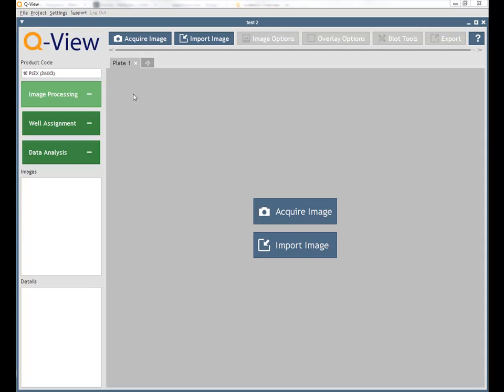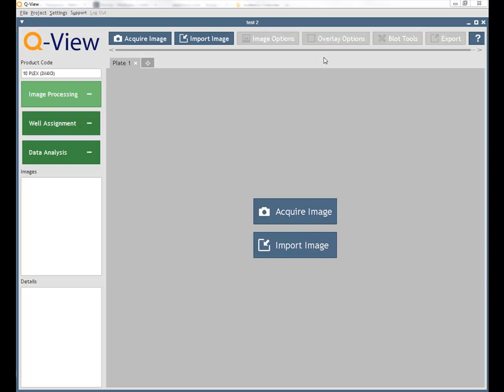Using QView, multiplex analysis is performed in three easy steps. We begin with image processing, which includes capturing or importing images of your micro-well plates and aligning the plate overlay to fit the wells within each plate.